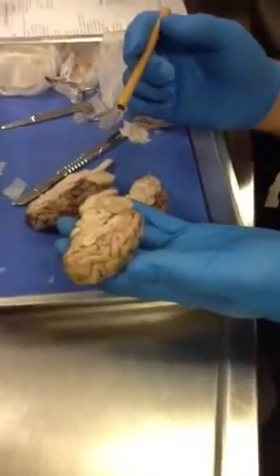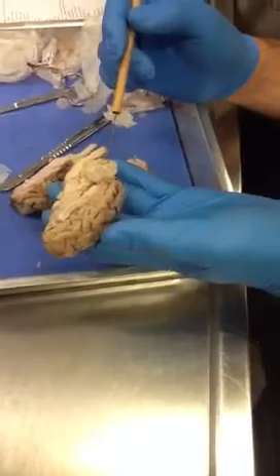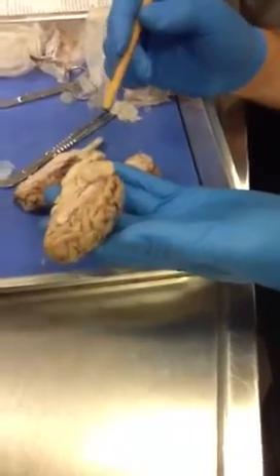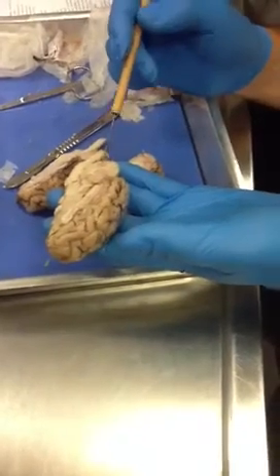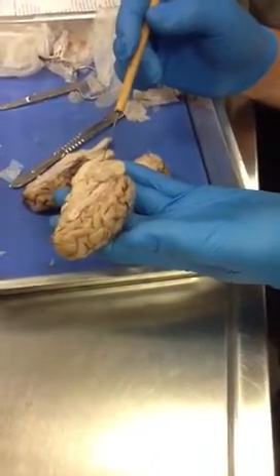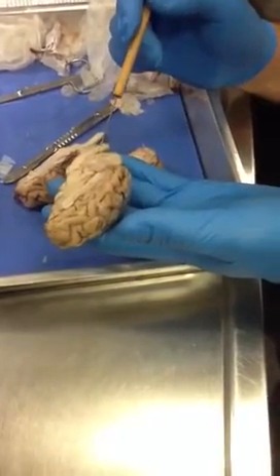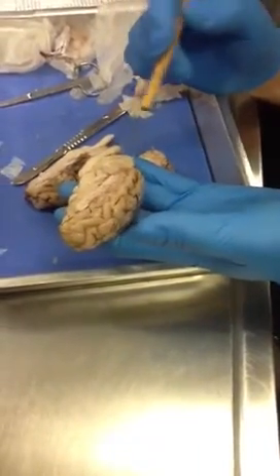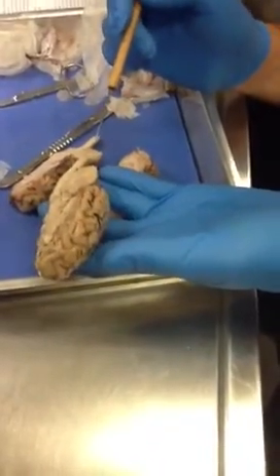Okay, last couple things. When you look at the cerebellum on sagittal section, you'll see what looks like the branches of a tree. Okay, so the white part, the white matter on the inside, looks like branches. We call that the arbor vitae, which means the tree of life. Like Arbor Day. Arbor vitae, tree of life. And then all the gray stuff is on the outside, but we call that the folia, like foliage on a tree. It looks like the leaves on a tree.